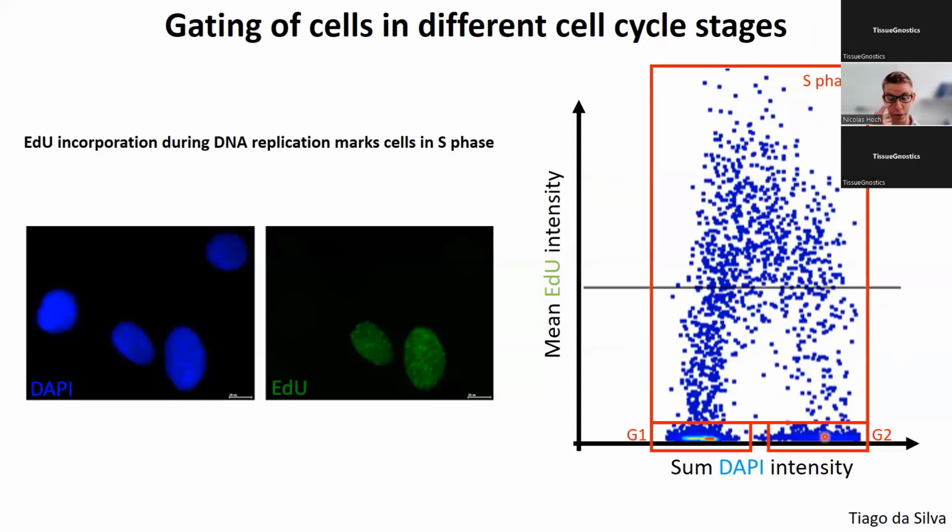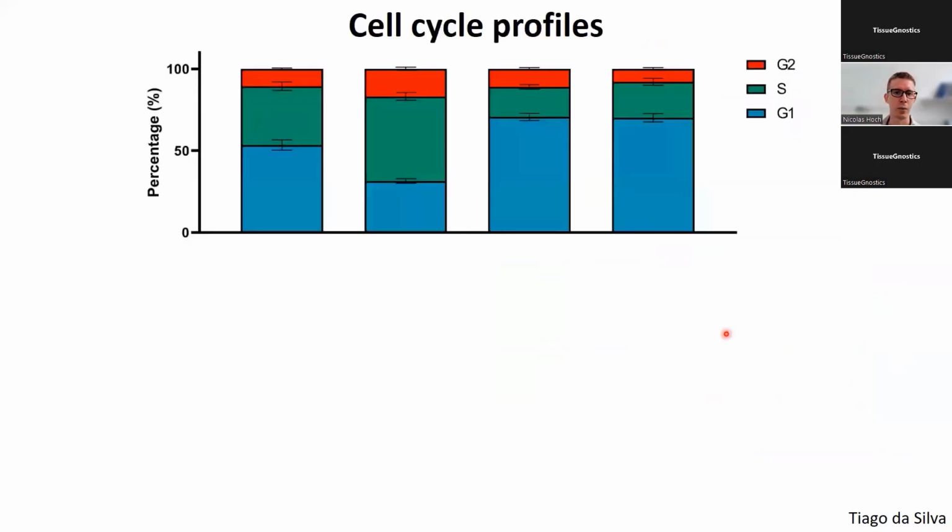And so with these sorts of graphs, you can now quite easily determine changes in cell cycle profiles, for instance, between different treatment conditions. So, you know, our untreated population is like this, and then you treat your cells with something that damages DNA or whatever, and you get, in this case here, an accumulation of cells in S phase, or in this case here, we had an accumulation of cells predominantly in G1.